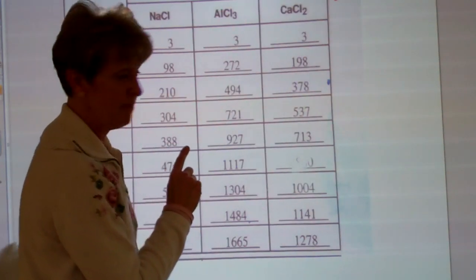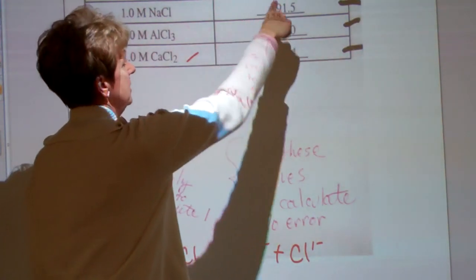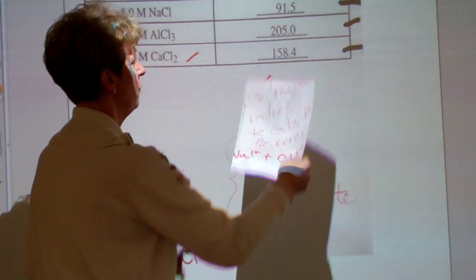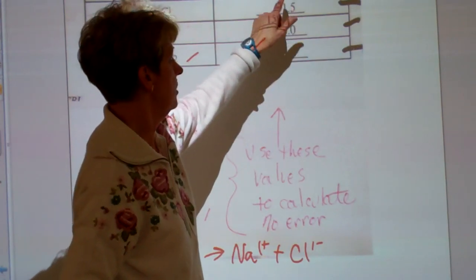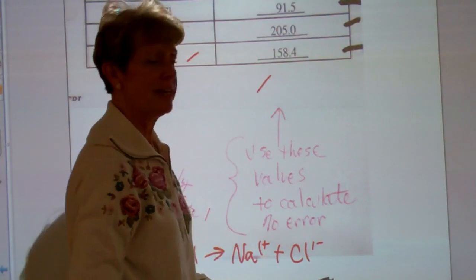What you do have is this next slide. You have slopes. Now, before you get all worried here, you were able to get off of your graph of your data various slopes. Write these numbers down. I'm not sure you can see them.